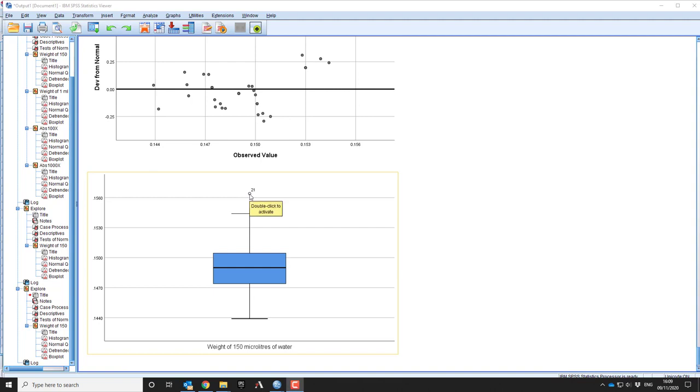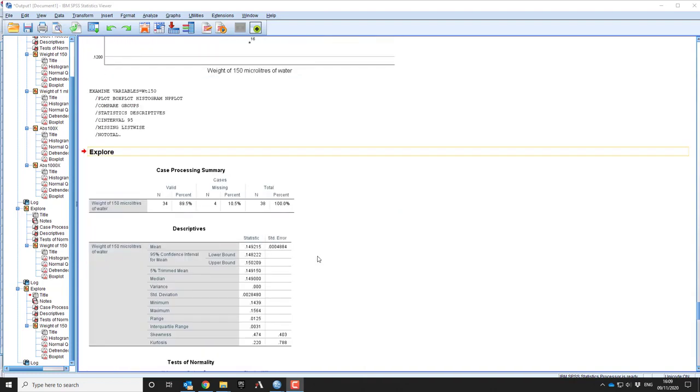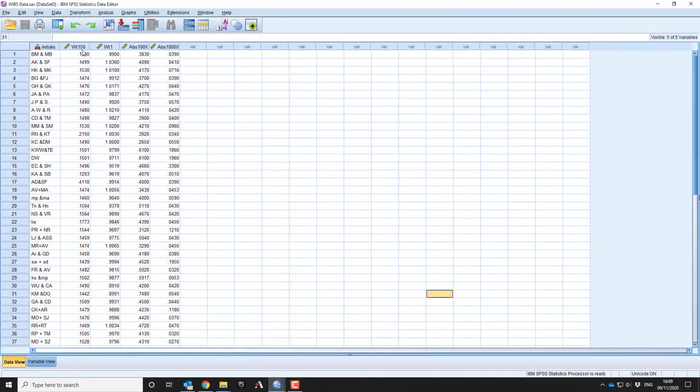There's still one that's a touch too high, but anyway, they've got good agreement. Now, having a look at the next one, do you want to look at the weight for the next for 1 milliliter?